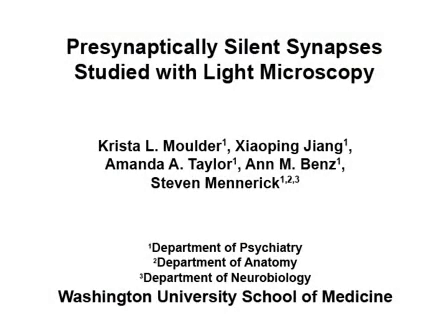Some presynaptic terminals in the central nervous system appear non-functional or silent. Here we present a protocol for identifying silent presynaptic terminals. This protocol can be applied to identifying treatments and manipulations that are suspected of silencing or awakening terminals.